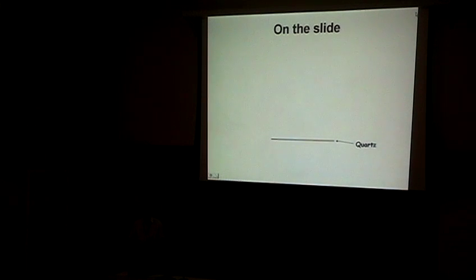So how do we do the measurement? We start with a slide made of quartz, and we coat it with aminopropylsilane to present amino groups on the surface. Then we add polyethylene glycol carrying amino-reactive groups so that it can passivate the surface with a dense polymer coating, a polymer brush, so that the proteins we want to study do not stick to the underlying glass surface. This is a very important technology. And some of the PEG molecules have a biotin label at the end.